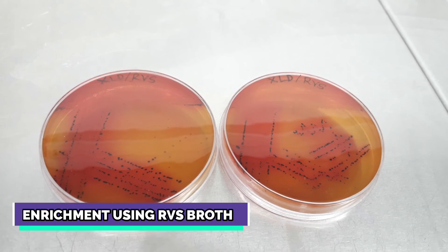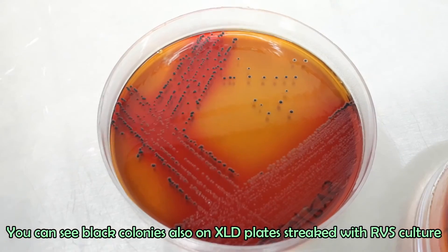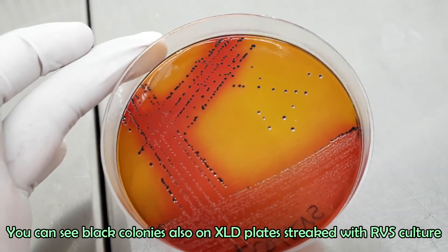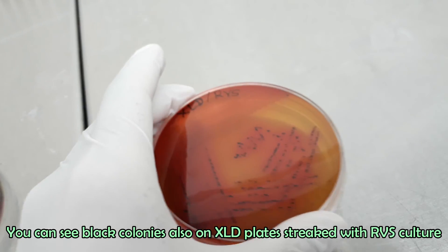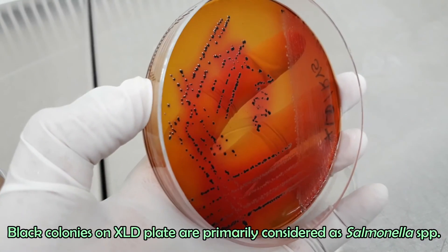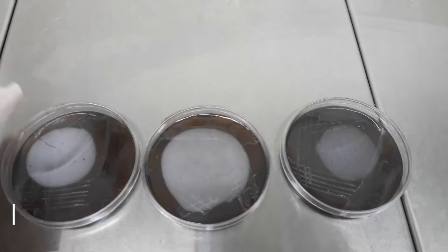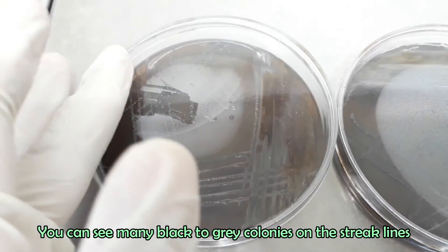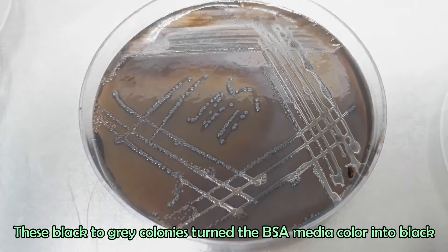Let's observe the XLD plates which were streaked with RVS broth culture. Many black colonies are seen on streak lines; these black colonies are primarily considered as Salmonella. Let's now observe the BSA plates. The BSA plate with MKDTN culture shows many black to gray colonies which turned the media color into black. The BSA plates streaked with RVS broth culture also contain many black to gray colonies which turned the media color into black. These colonies are mainly considered as typical Salmonella colonies.